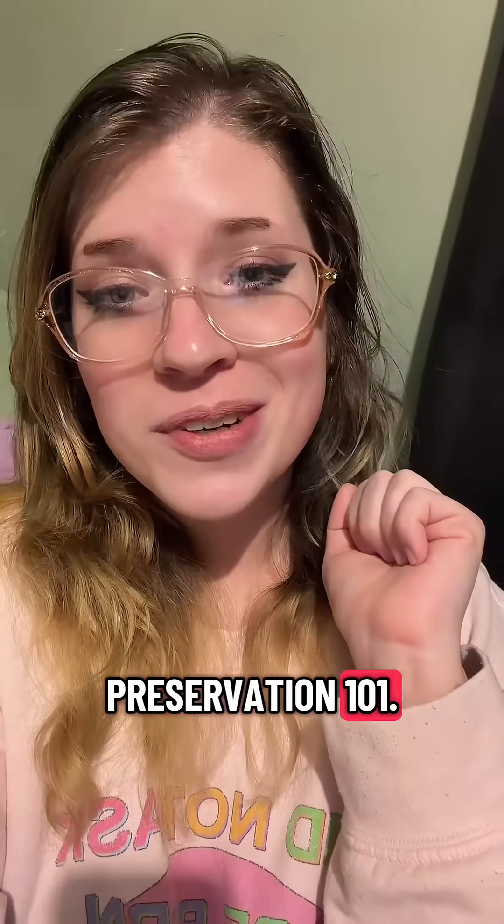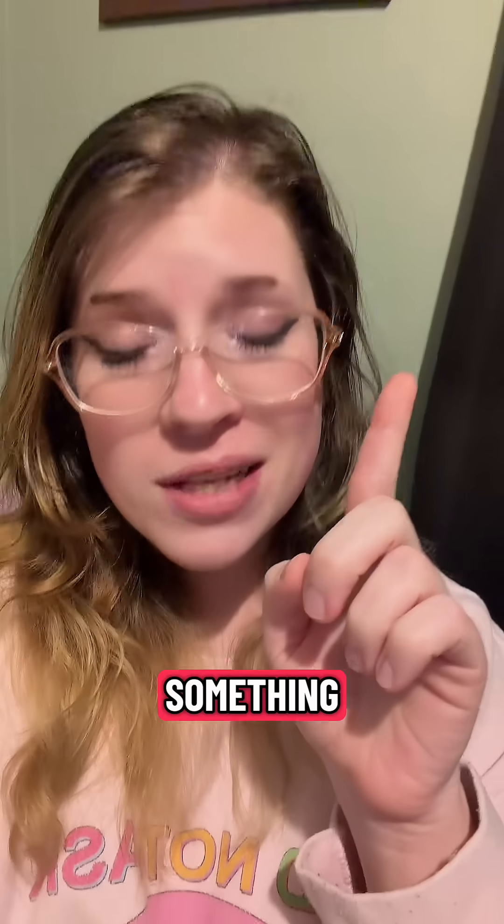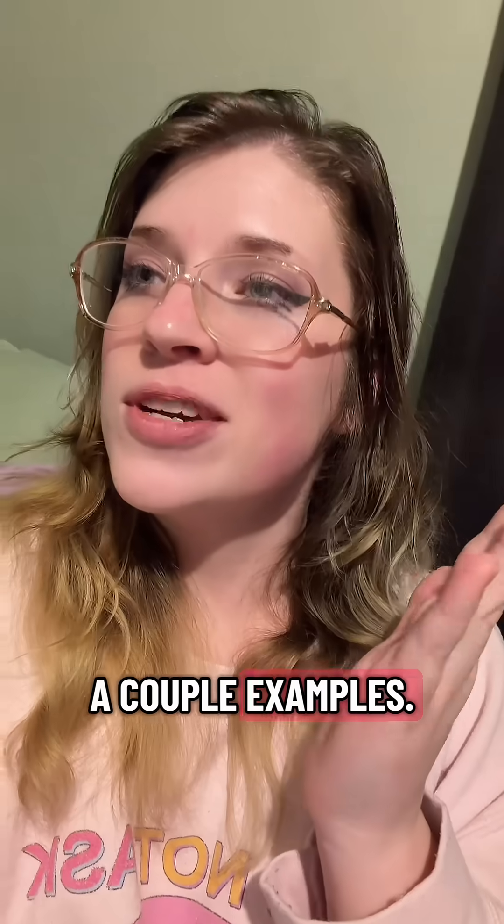Welcome back to bug pinning and preservation 101. This is an excellent question — give you a moment to pause and read. Can you pin something that small? Yes, I'll show a couple examples.